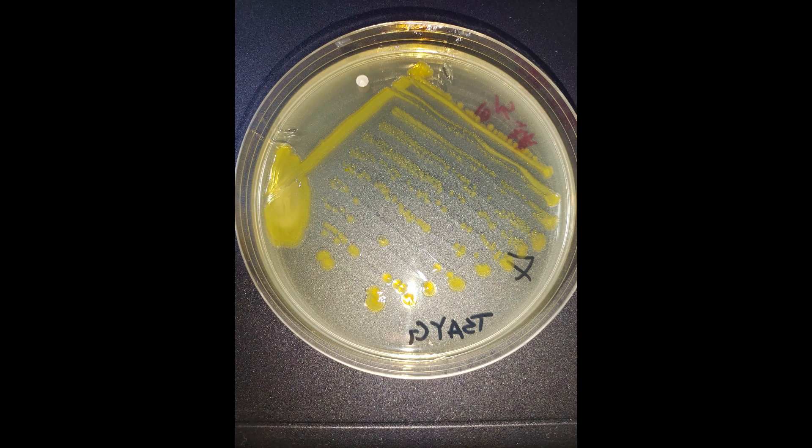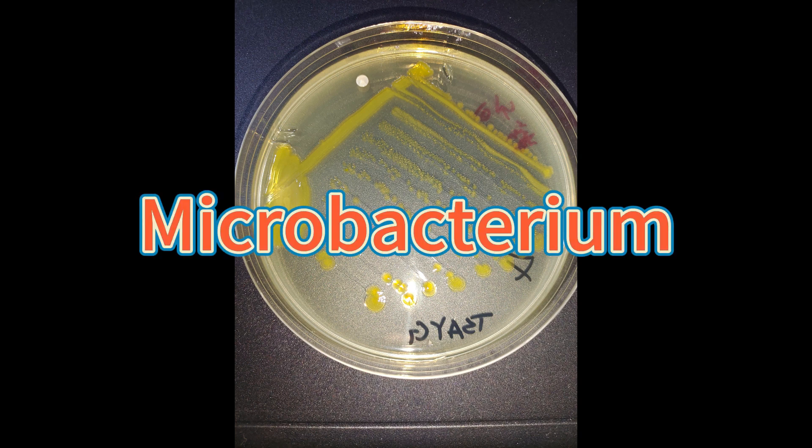The fourth one is a bit tricky. It is gram-positive, very short rod or coccus, I'm not very sure about this one, and has this small green colony. The AI thinks it's also Pseudomonas, despite it would be gram-negative if it's Pseudomonas. So my pick is the viridans streptococci to be my answer, and the answer is Microbacterium. Well, I'd say my answer is more creative though.